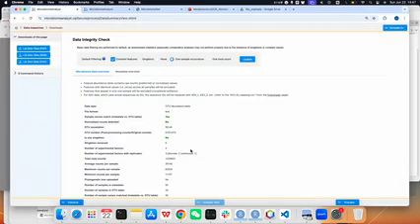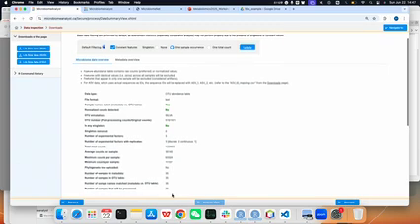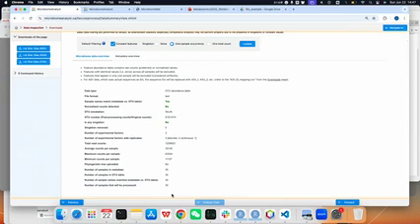Now we get to the sanity check page. Here we get an overview of our microbiome data. We can see exactly what we have input, like how many samples and how many sequences. And then if there are singletons, the summary of your metadata, the minimum and maximum counts for the samples, and if all the samples are matched. Here everything is all right for the example data.